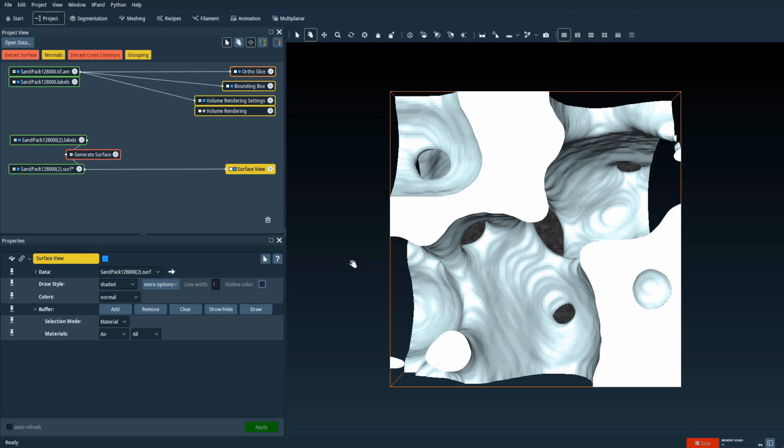So you can save your project and data sets on an external hard drive, or in the cloud, or in any of KAUST's network-based storage like DataWaha, so that you can access your project from the VisLabs VR facilities.